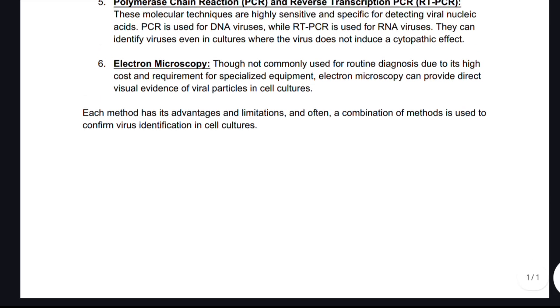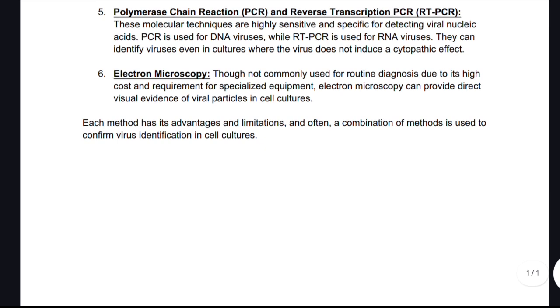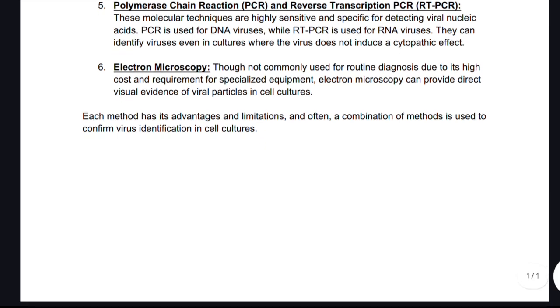Basically, electron microscopy is not cost effective and its requirements are too high, so therefore it is not put into practice regularly. Electron microscopy can provide direct visual evidence of viral particles in cell culture.